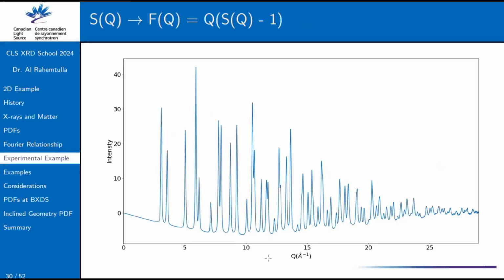So I would say with something like that, there would have to be a use case, unless you think there's maybe something amorphous in there at very low angle. It would be very difficult.